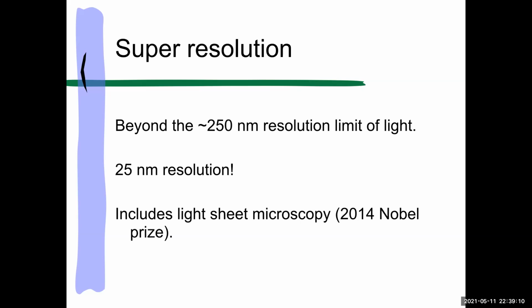And the possible highest NA that you could have is 1.5, and the lowest light you could be using might be 400. Sometimes we're using UV, which is a little less than that, but generally 200 to 250 nanometers. As I've said, I'll say something in that range because again, it depends on your scopes. Let's just say theoretically you could get 200 nanometers, but really you'd be lucky to get 300 nanometer resolution in best case circumstances. So let's call it 250.